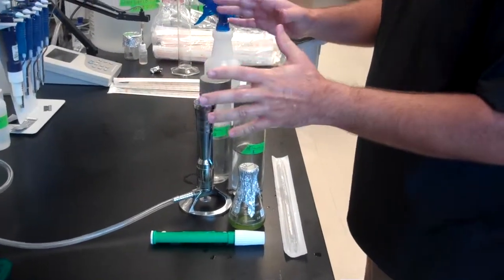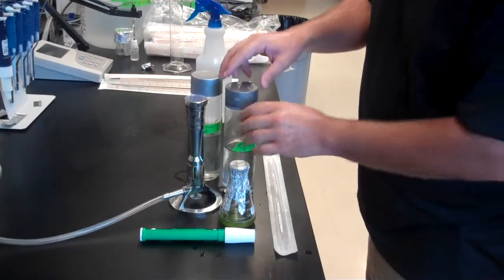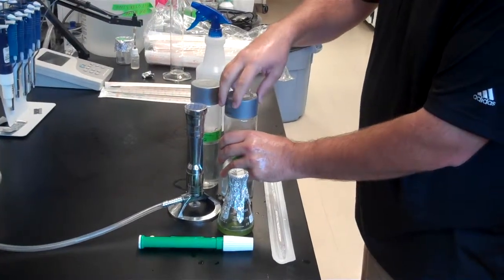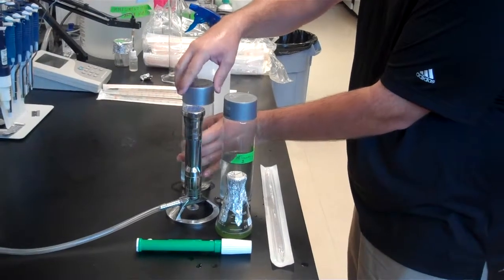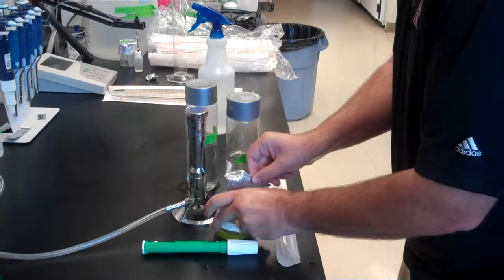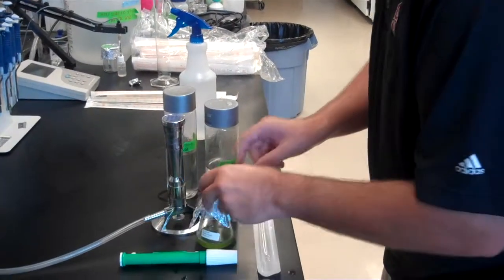That way, my hands are going to stay in this field for the rest of this entire video. Okay? So the first thing I want to do is loosen up the lids, but not take them off. Do not want to touch the inside of any of these, so I'm just loosening them up for now.